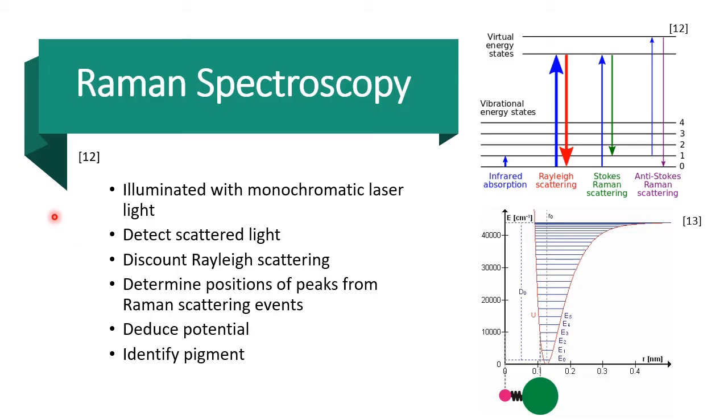Briefly, let's talk about Raman spectroscopy and how it's performed. Well, first, a sample is illuminated with monochromatic light from a laser. When photons scatter at the interface between the air and the pigment, most will scatter elastically, but a small fraction will scatter inelastically, which is what we're interested in. This is because of transitions in the vibrational modes of pigment molecules, which can either increase or decrease the energy and hence the wavelength of each photon involved in the inelastic scattering event. These transitions are pigment specific and are dictated by the potentials between its constituent atoms, producing spectra that acts as a pigment-specific fingerprint, making it very reliable for detecting the correct pigment.